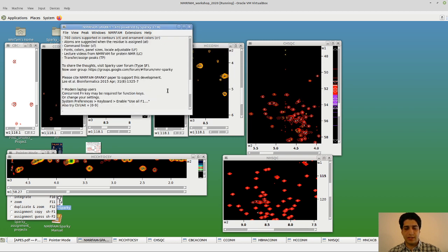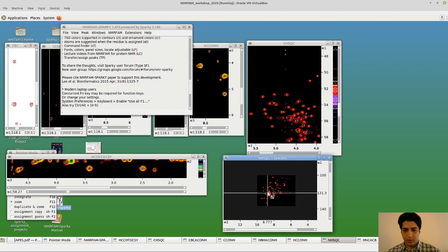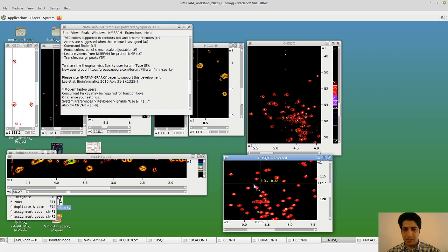So the next step here is to go over these results and delete the very obvious noise. For that, we are going to do one more thing. So start with NHSQC, and we want to make these peak sizes just bigger.